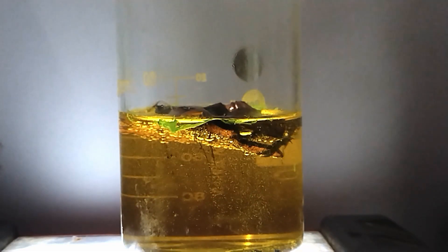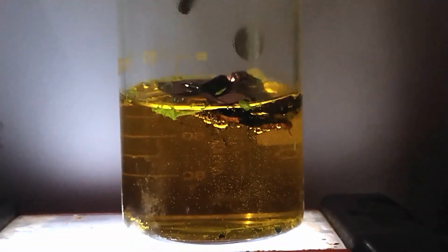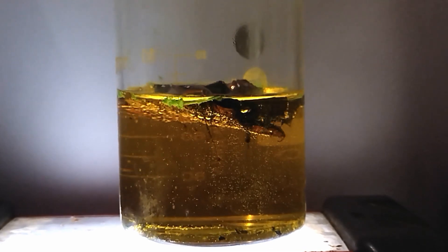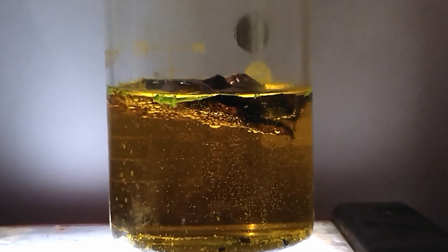The nitric acid is oxidizing the copper, breaking it down into copper ions, while the hydrochloric acid keeps those ions dissolved. This creates copper chloride, which gives the solution its green and blue color. Nitrogen dioxide is a toxic gas produced when the nitric acid reacts with matter. This is why aqua regia is not something to mess around with.